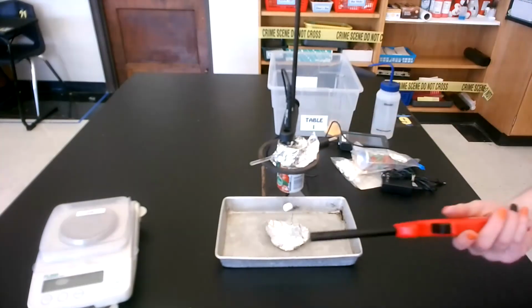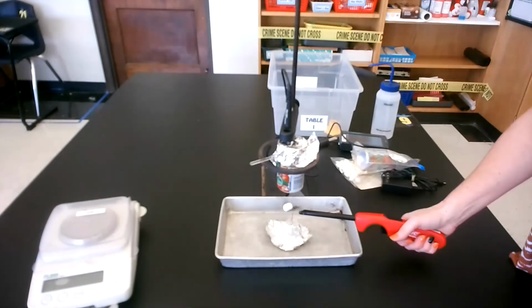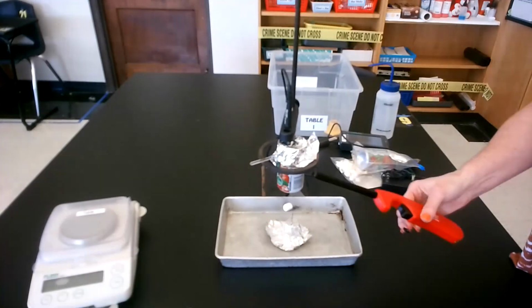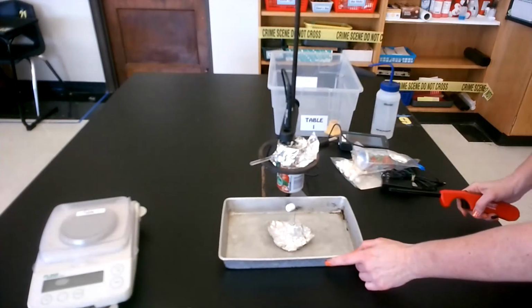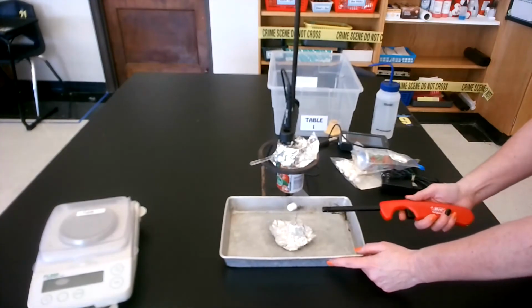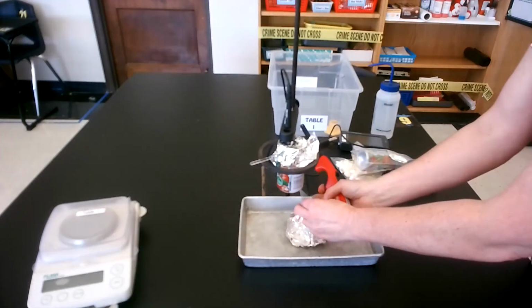On this, we're going to use our lighter, whoever's comfortable with that. Now, if I put the lighter directly under the food, which is directly under the can, I'm finding the heat given off by the lighter and not the heat given off by the food. So I'm going to be moving this a lot. You can have one person moving this, one person lighting, or one person doing all of this. It's up to you. So let me make sure my food's in there just right.